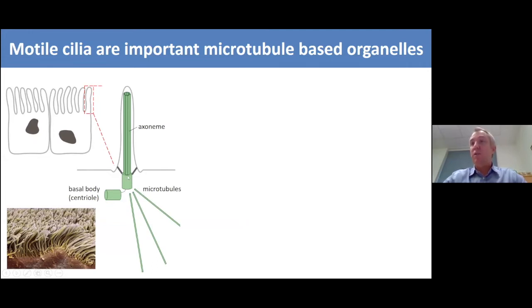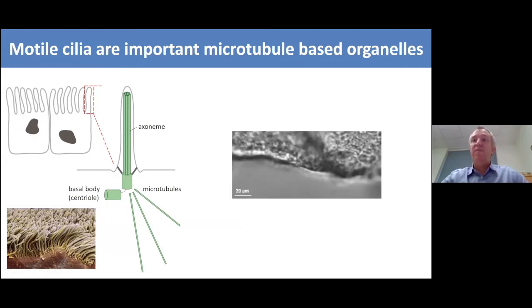Their key function, of course, is to move. And what this video shows is some ciliated epithelia, and you can perhaps make out that there's this flow of material past these continuously beating cilia.